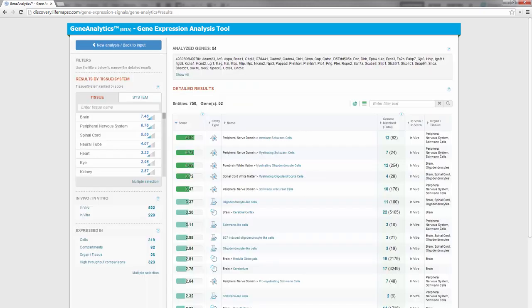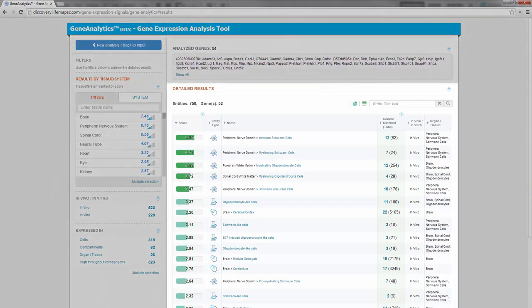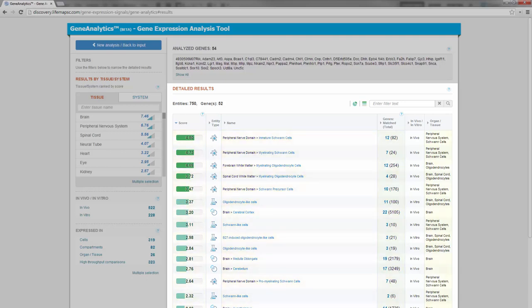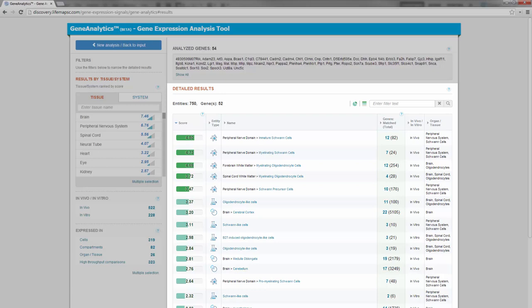The result page in Gene Analytics is divided into two parts. On the right side is a detailed table that shows matched entities, matching scores, the list of matched genes, and tissue annotations. In this table, all matched entities are ranked by their matching score.